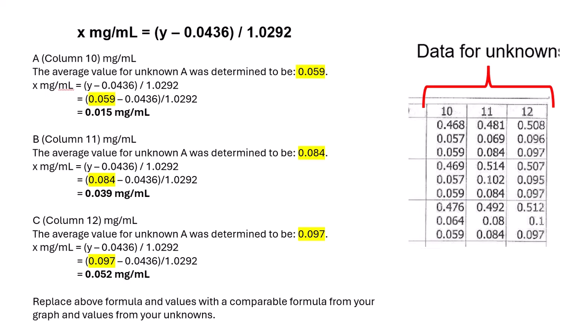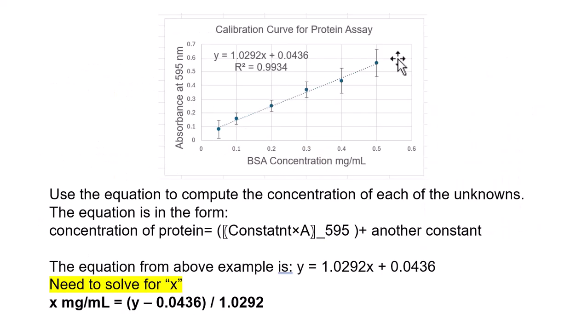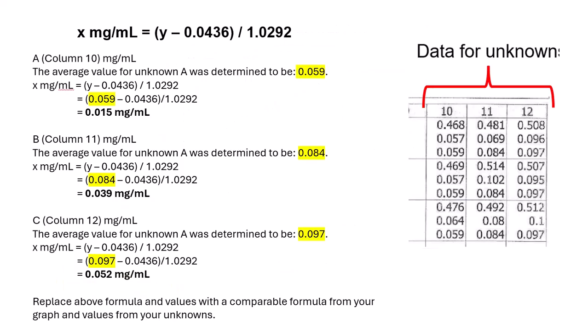So we've generated our calibration curve. We have a formula for that, and now we can actually plug absorbance values into that equation to get calculations of concentration. What we really want to know is the concentration of the proteins in our unknown. This curve represents our known concentrations versus the absorbance. So now we have to see where our unknowns fit in this. We don't just go by the absorbance. We have to convert it to concentration data to compare concentrations, not absorbances. That's an oftentimes made mistake.